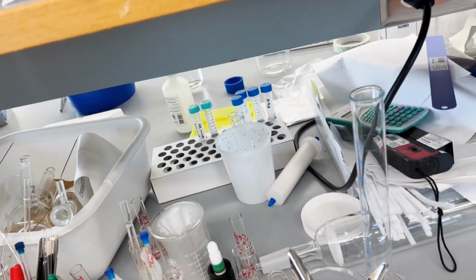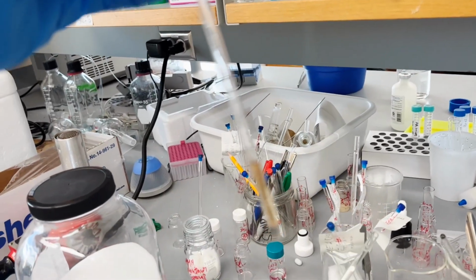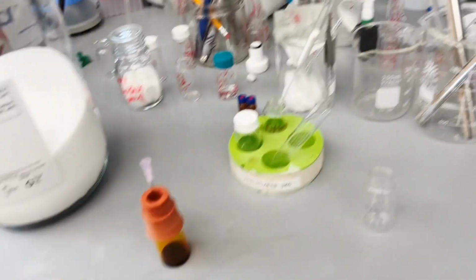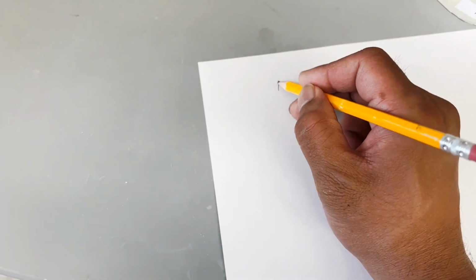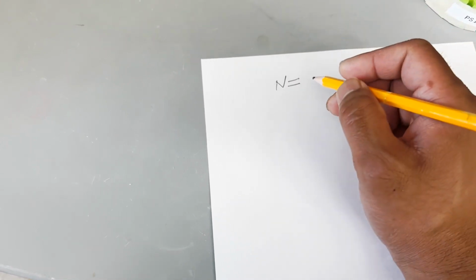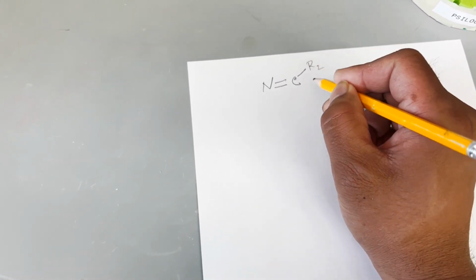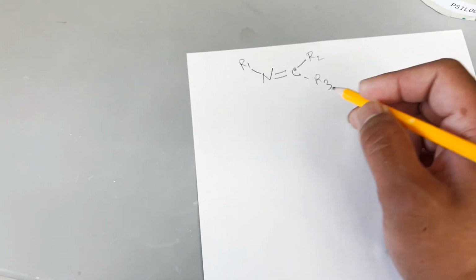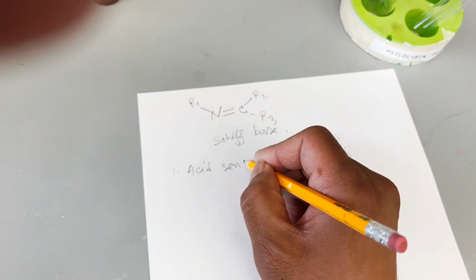As I was saying, silica gel is a little bit acidic, so if you use silica gel to purify this Schiff base, then it will break down. So here I'm writing a summarized situation, so you can keep it in your mind while you're making your Schiff base. Hopefully this video will help you to set up the reaction, to understand the reaction, and gain experience to do these reactions and to handle these Schiff bases.